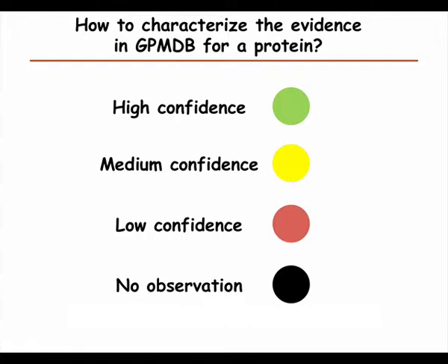So we've been trying to look at how we can at least qualitatively characterize and divide proteins into high confidence, medium confidence, or low confidence.